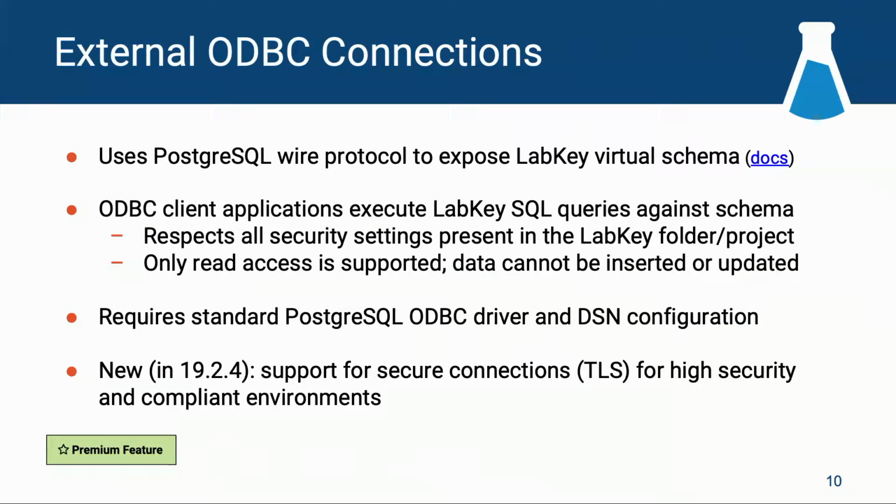Next, we'll look at one of our most recent integration solutions. That is to support connecting to LabKey data using an ODBC connection. This is done by implementing the Postgres wire protocol within LabKey Server. Each LabKey project, which is a container or folder, is exposed to the third-party tool as a separate Postgres database. The database then lists LabKey query schemas. If you are familiar with LabKey's schema browser, this is the same data presentation as in the LabKey schema browser.